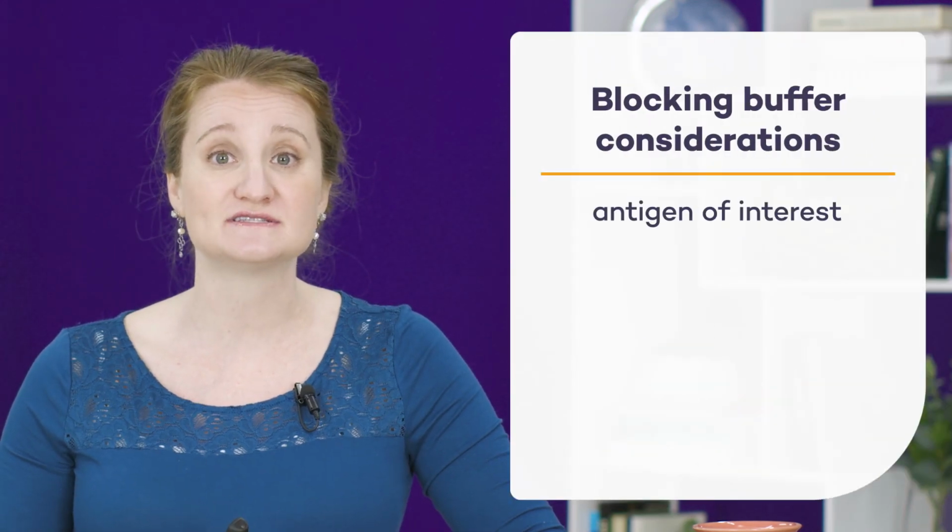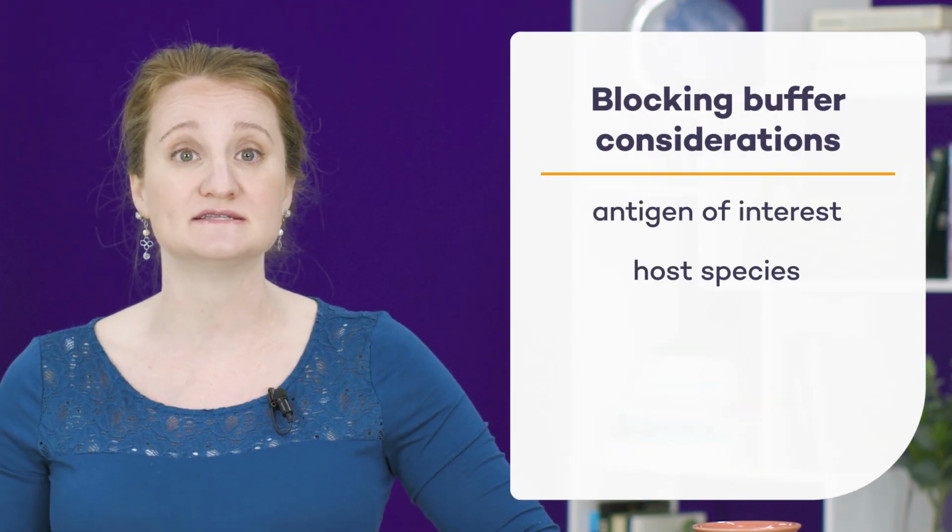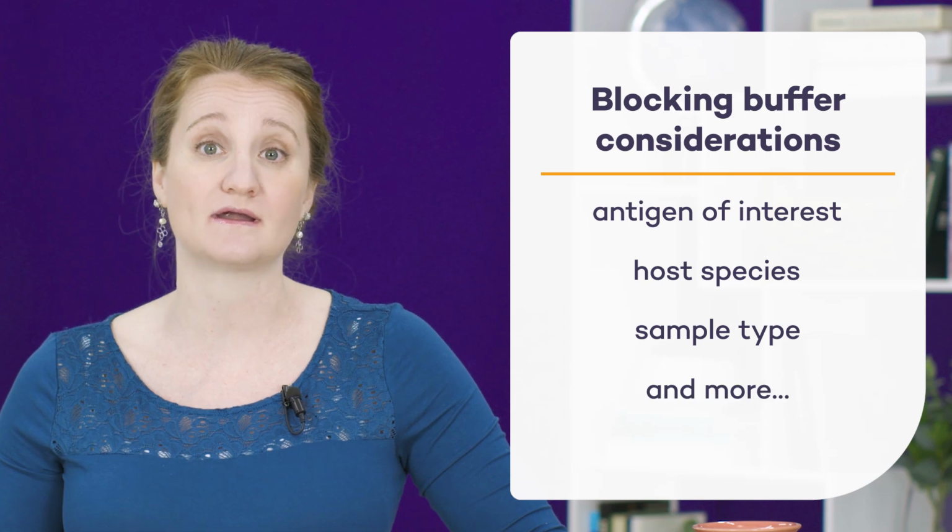One question that I'm often asked is, what is the best blocking buffer to use for my experiment? And my response is, well, it really depends. There are many factors that come into play when deciding which blocking buffer you want to use for your experiments. These factors include the antigen of interest, the host species of your antibodies, the sample type, and so many more.